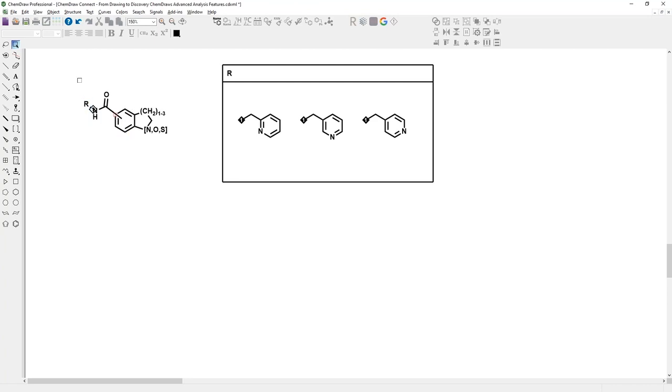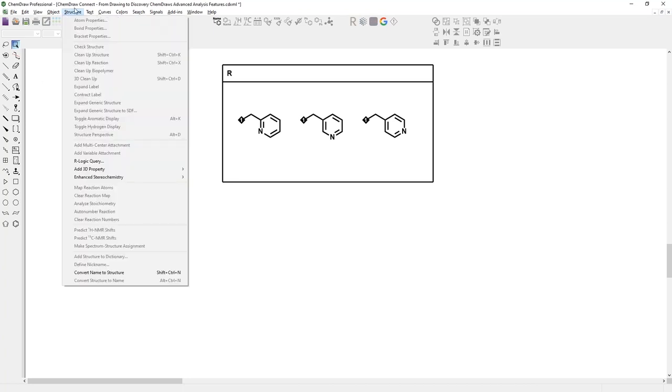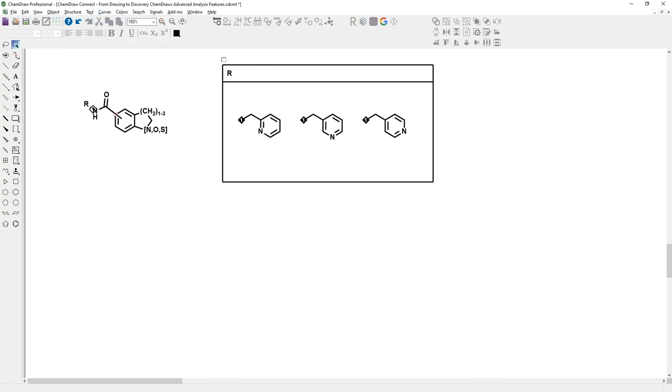And I guess the most powerful one, maybe also the most known one, is then that you can define also residues, so R groups. And the way you do this is that you give them a name, and that you also then use later on the name here in that table. And you don't have to call it R, R1, etc., but it's important that you give them the same label, same name.